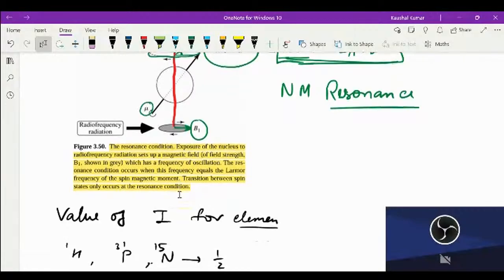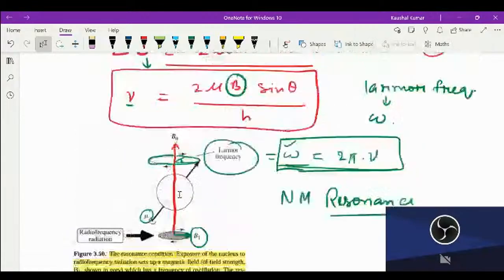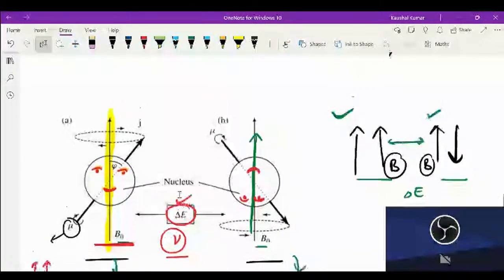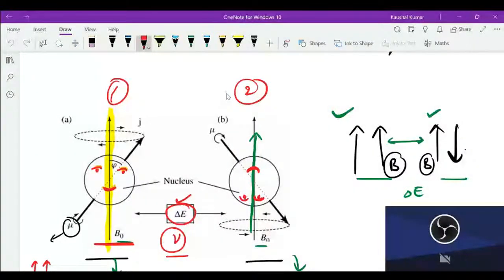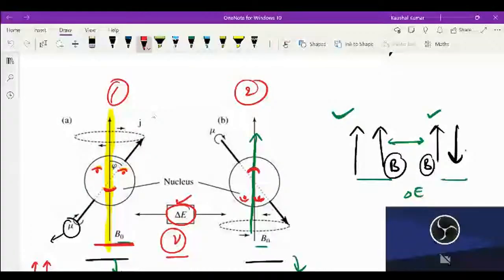Okay, I will repeat it again, even though you understood, because you are not saying. From this state to this second state, we found the difference in energy. Now the important thing is that the change in frequency will be important.